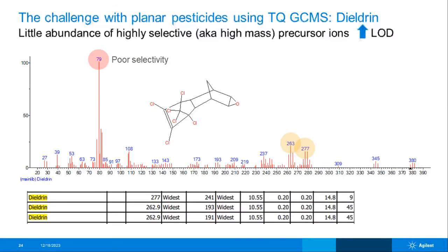And again, why did we use this technique specifically, solvent vent mode, for these organochlorine pesticides? Right here is a good example of why we chose solvent vent mode, by talking about dieldrin and endrin. They are two known compounds that will break down in a hot inlet. So by doing a cooler inlet and by injecting a lot more onto column, we're actually able to obtain the sensitivity that we need from them.